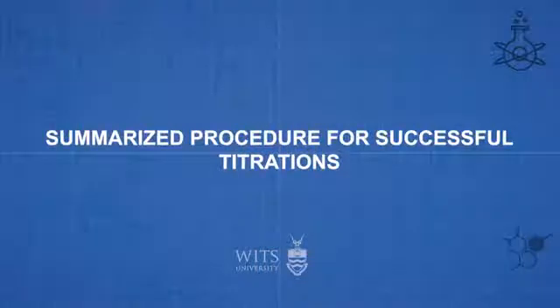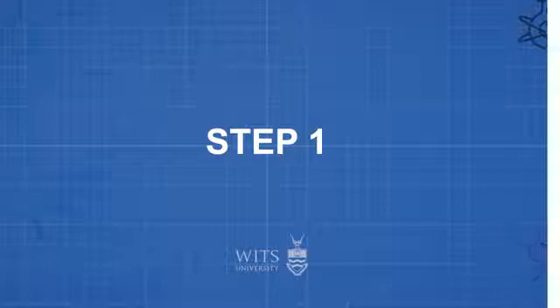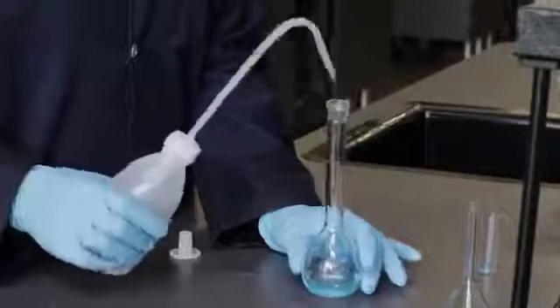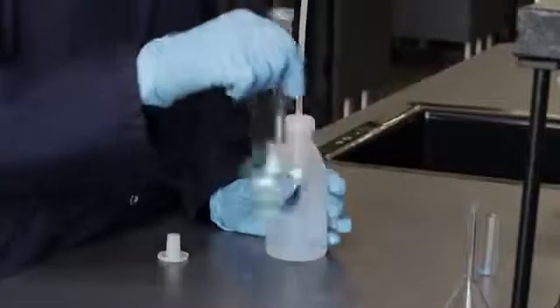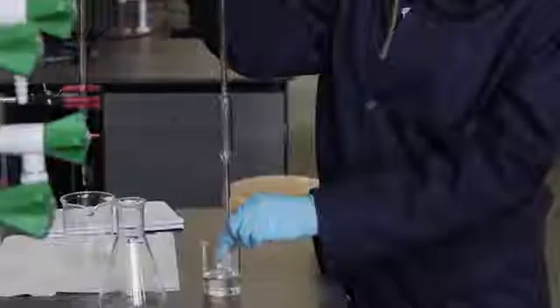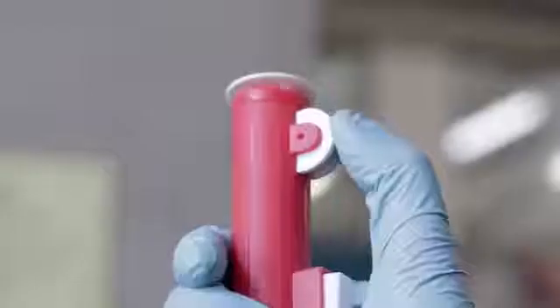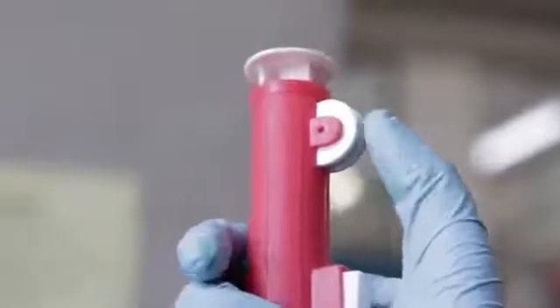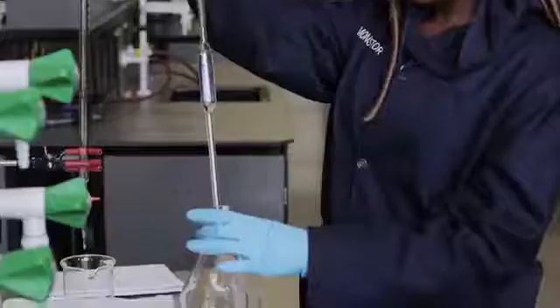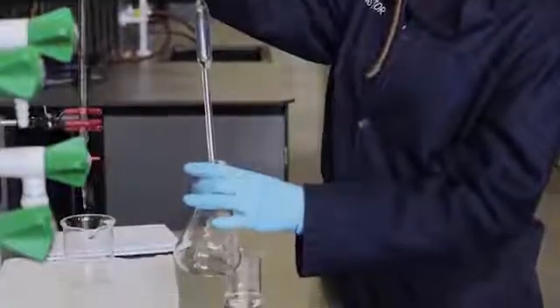Here is the summarized procedure required for successful titration. Step 1. If the sample is a solid, it is weighed and then dissolved to make up a known volume of solution in a volumetric flask. Step 2. A pipette is used to measure accurately a volume of the solution, for example, 10.00 milliliters. This is emptied into a conical flask.